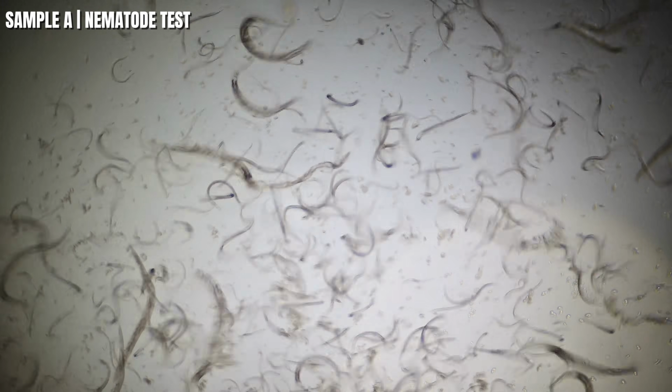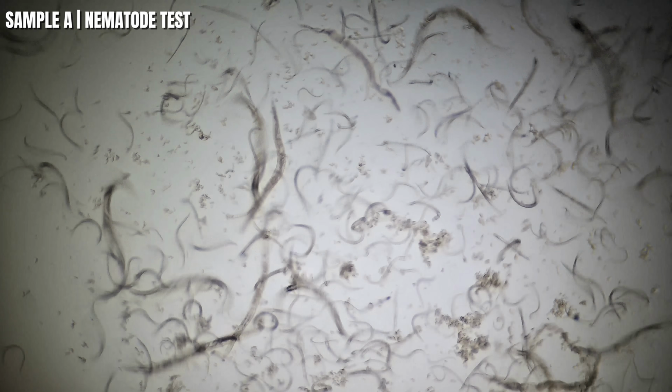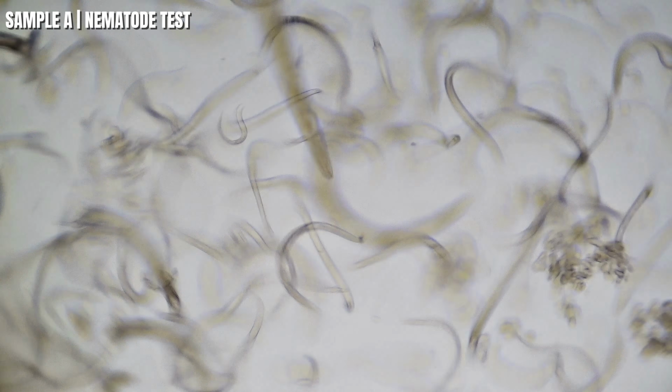Okay guys, before we get started, let me introduce you to the star of today's experiment. This tiny worm is called Caenorhabditis elegans, or C. elegans for short. It's a free-living nematode that's only about 1 millimeter long, but don't let its size fool you. It's one of the most studied animals in science. These little guys spend their lives feeding on bacteria in the soil and in my lab. They're eating E. coli, which is their standard food source.